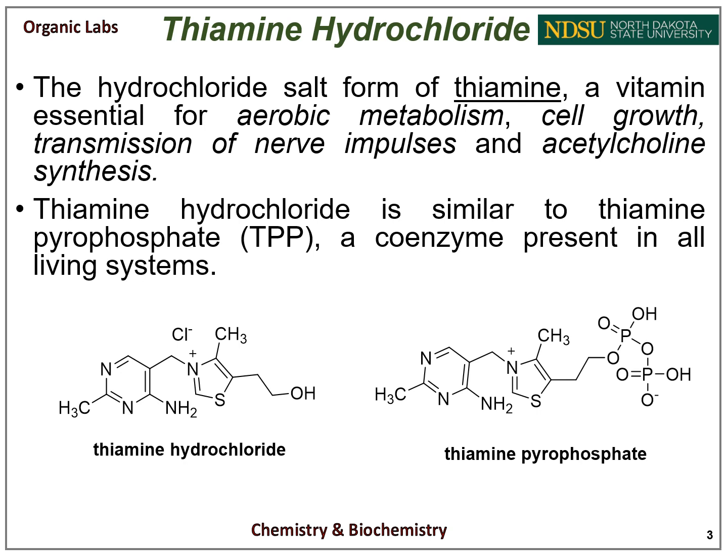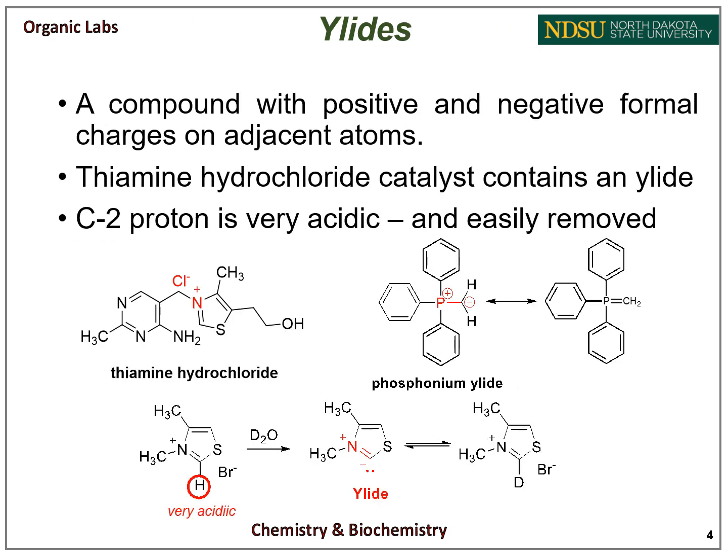Thiamine binds to an enzyme before the enzyme is activated. The enzyme also binds to the substrate. A ylide is a compound or intermediate with positive and negative formal charges on adjacent atoms. Thiamine hydrochloride catalyst contains a ylide.